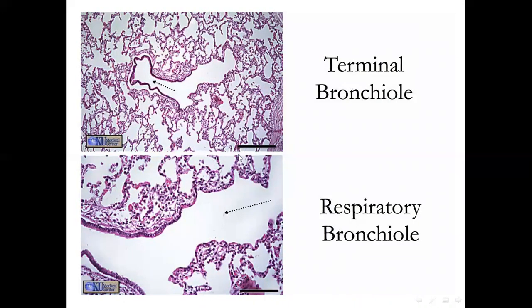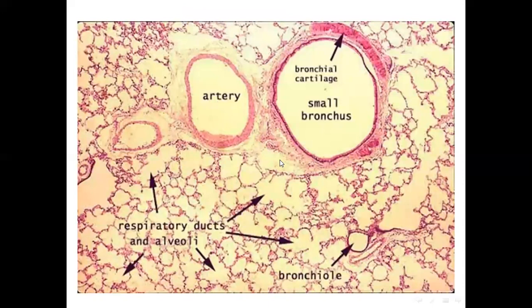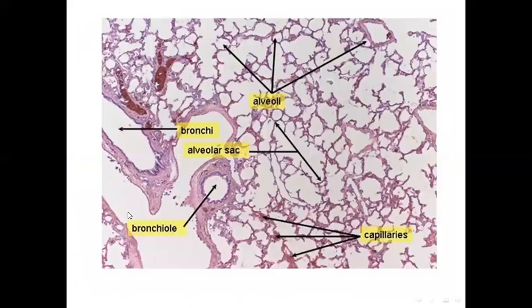After that we come to the alveolar duct that arises from the respiratory bronchiole. من respiratory bronchiole. تمام. هذا الدكت نجي اشوف. اوكي، هذا من هنا عندنا alveolar duct, alveolar sac اللي يحوينا على more than one alveoli. اوكي.